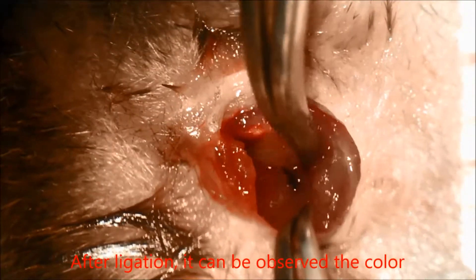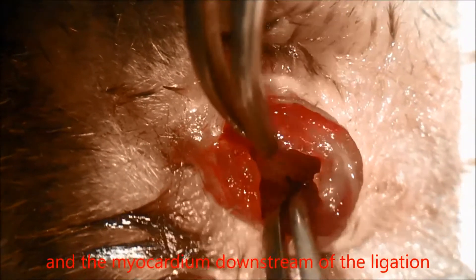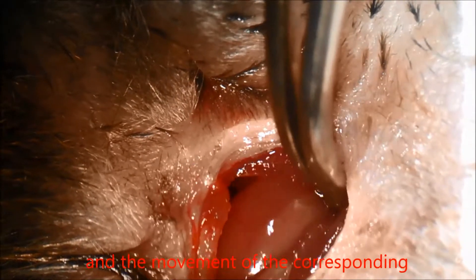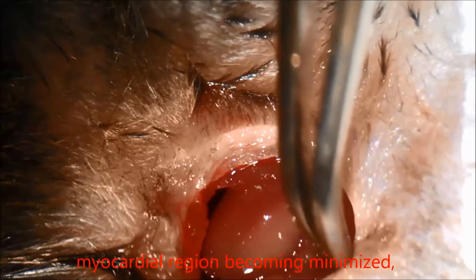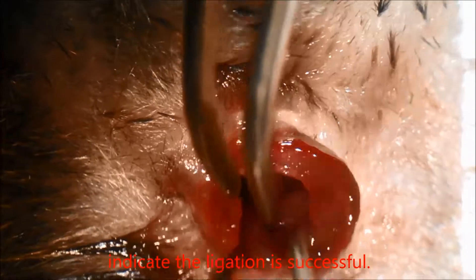After ligation, it can be observed that the color of the local area surrounding the ligation and the myocardium downstream of the ligation simultaneously becomes pale, and the movement of the corresponding myocardial region becomes minimized, indicating the ligation is successful.